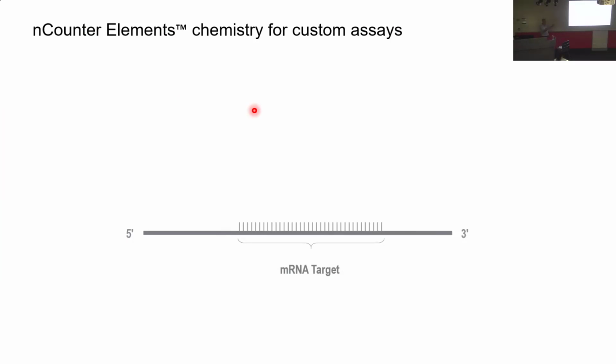They're big curated biology systems, biology scale panels. They run it. They get enough data that, typically, I've seen people get multiple publications out of one run because the data is so rich and deep and so beautifully curated. But that's really what people mostly use. But in New Zealand, it's the opposite. People do smaller scale things. And I thought that might be more appropriate here because you're not doing large clinical type work here, I would imagine. And you might be using odd species.